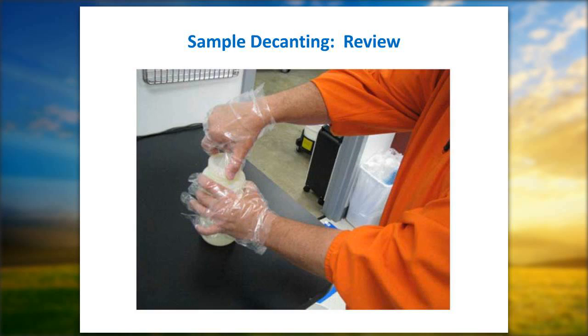Next slide, please. Okay, I've got the gloves on. I poured my sample. I've got the lid back on. Now that sample's capped, and make sure that it's nice and tight. And this particular sample is in the process of being on its way to the Central Analytical Laboratory.